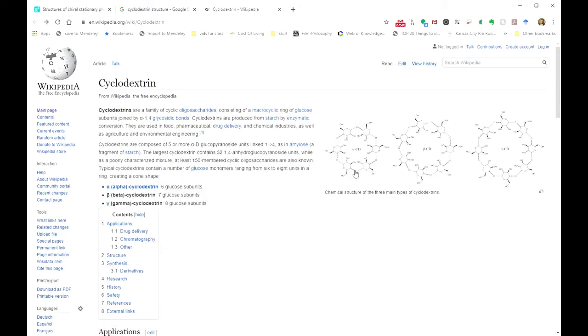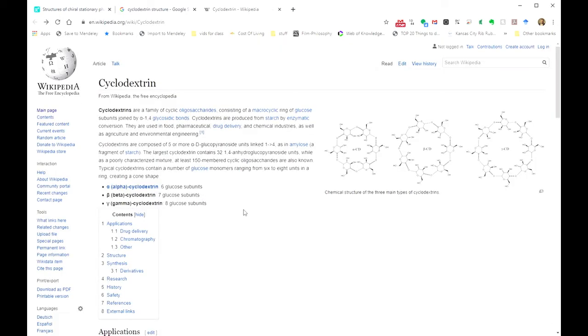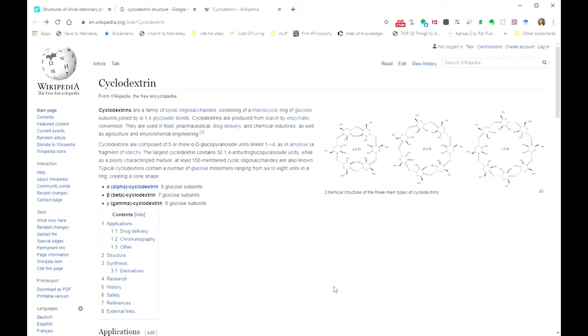But the point is that those glucose molecules have a handedness to them, right? They are D-glucose as they're represented here. And if we look closer, these CH2OHs are coming out of the plane at us because this is D-glucose. But if this was L-glucose, they would be going into the plane, which means that they can selectively interact with enantiomers, basically.